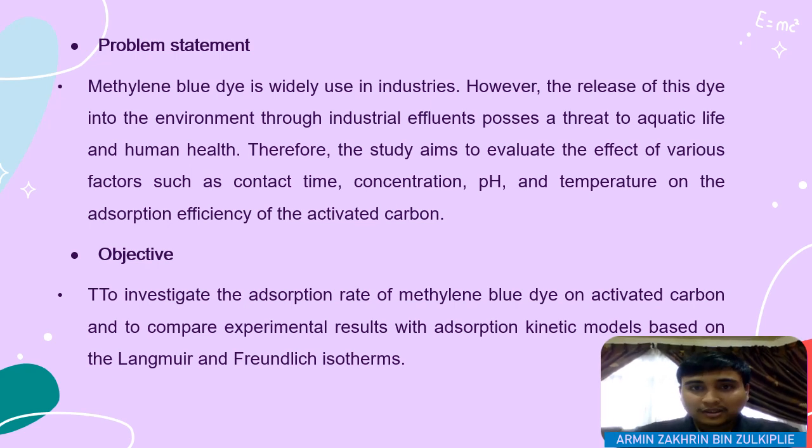Our problem statement is to evaluate the effect of various factors such as contact time, concentration, pH, and temperature on the adsorption efficiency of the activated carbon. Our objective is to investigate the adsorption rate of methylene blue dye on activated carbon and to compare the experimental result with the adsorption models based on the Langmuir and the Freundlich isotherms.